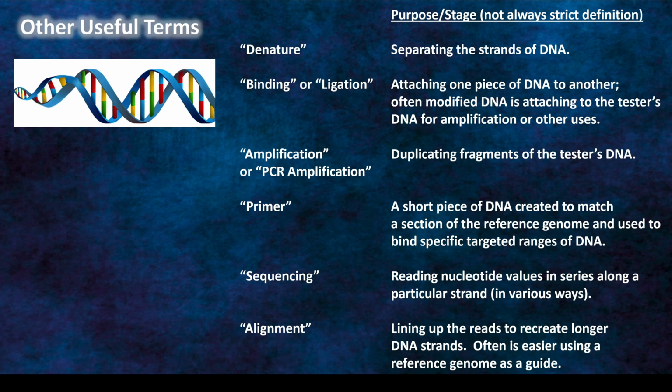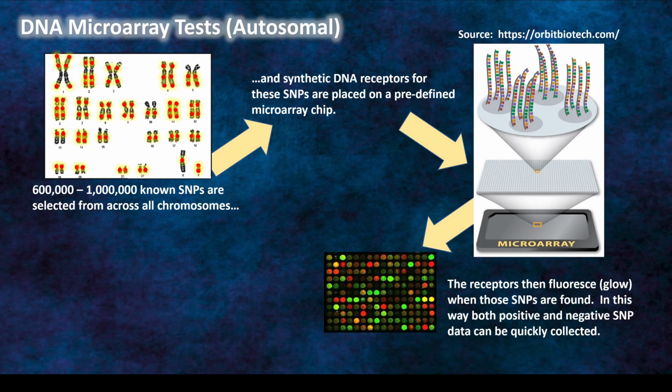So that's all the introduction that we need to do. Let's finally get into the actual testing itself. So we'll start with the DNA microarray tests. These are typically done for autosomal or mitochondrial DNA. They're often called chip testing as well.